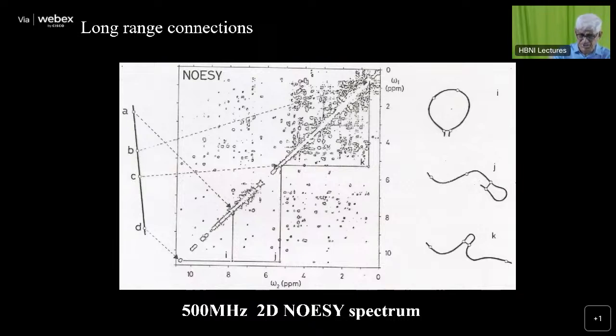So here this is rather not such a great spectrum, but it was one of the very first spectra. That's why I'm showing you this here. Today's spectra are far more complex than this, with a much larger number of peaks. But this was one of the very early ones, therefore I should give importance to that. That's why I picked up this one. So here, apart from the sequential NOEs which you have, suppose the polypeptide chain is like this, A, B, C, D.